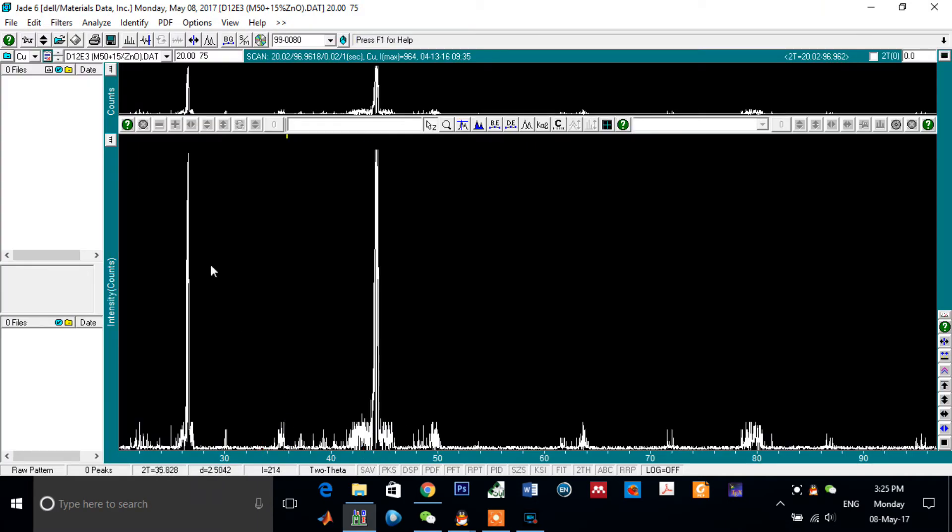First of all, this software is used to analyze the XRD data, X-ray diffraction data. And also it analyzes the peaks of diffraction of specific sample or powder.